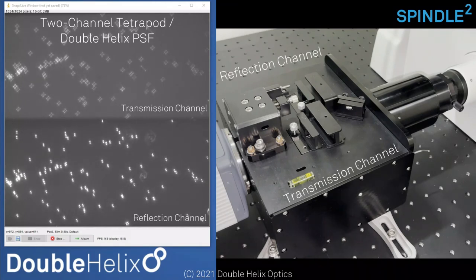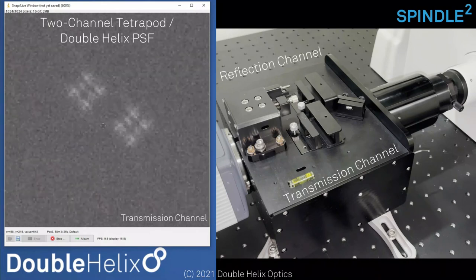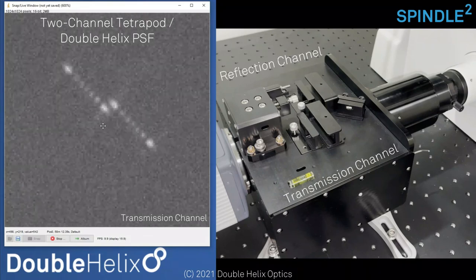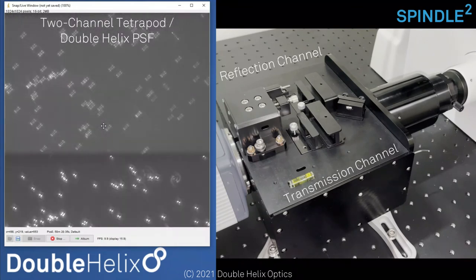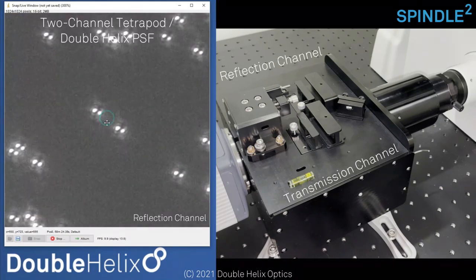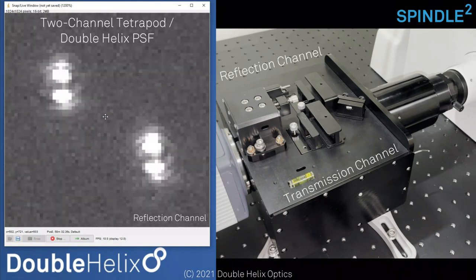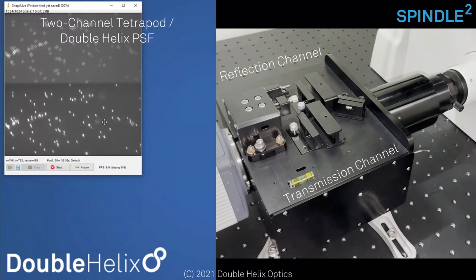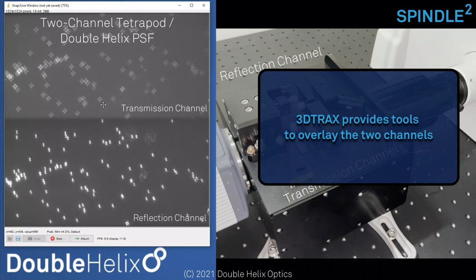With the lookup table adjusted, you should see a tetrapod on the top channel and a double helix on the bottom channel as we come in and out of focus. Zooming in on these two beads: here we're roughly at focus, we come out of focus and get that tetrapod shape, then back in and out again. On the reflected side with the double helix point spread function, you'll see the lobes rotate around each other. This allows you to do a lot of different experiments — like a two-color STORM experiment with two different PSFs, or two of the same PSFs with different colors, or clear aperture in one channel for a wide-field image while doing extended depth tracking in the other channel.